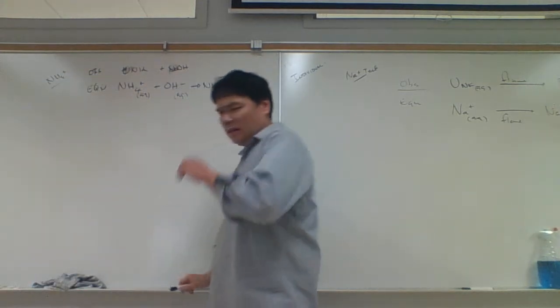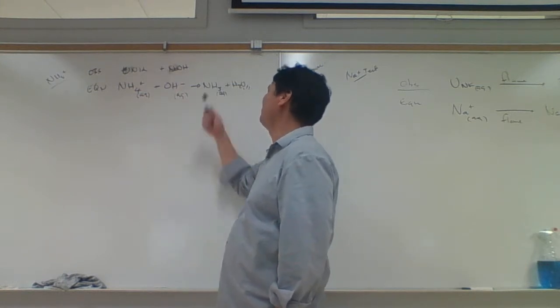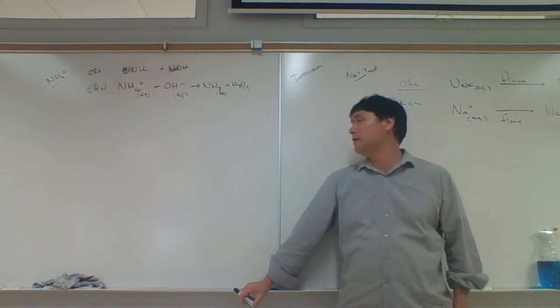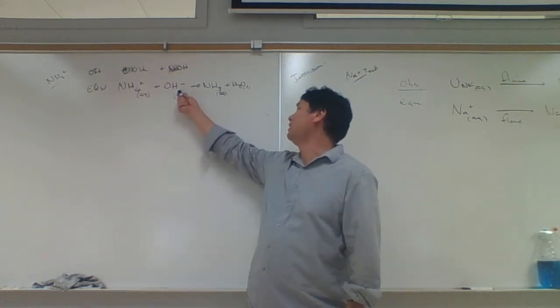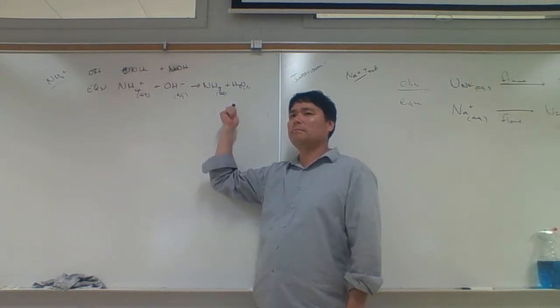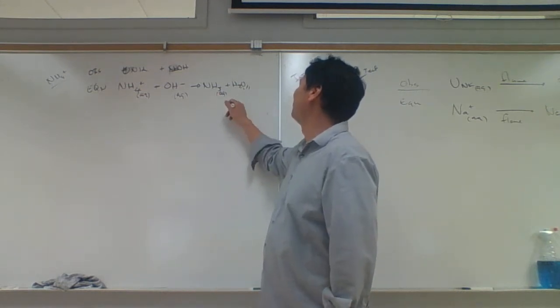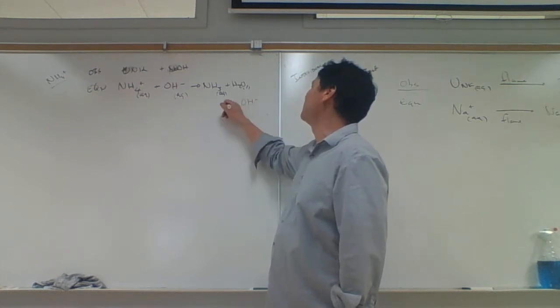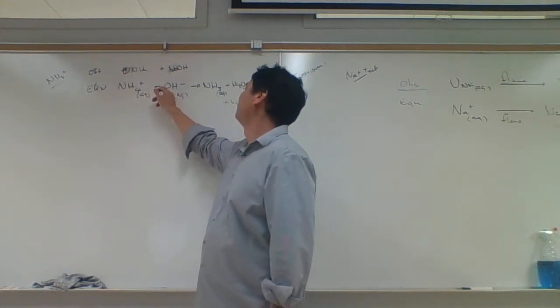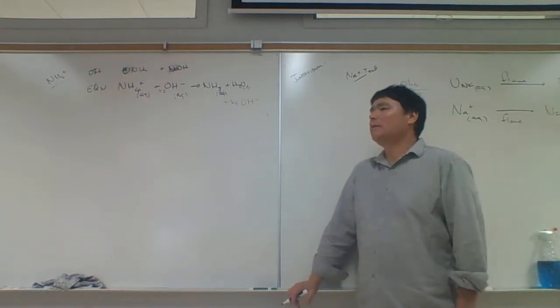And so this changes it from acid to base. Now we have base. How do we detect the presence of base? We could use litmus paper to detect the presence of the base, but the problem is if we have excess hydroxide, that will also react with litmus paper. And so what I need to do is separate the ammonia from any excess hydroxide that might be present here, because we're going to use excess.